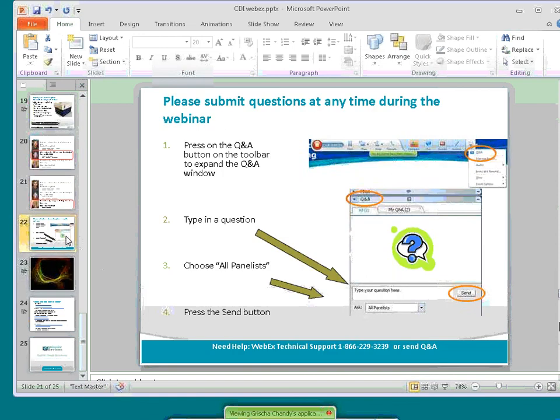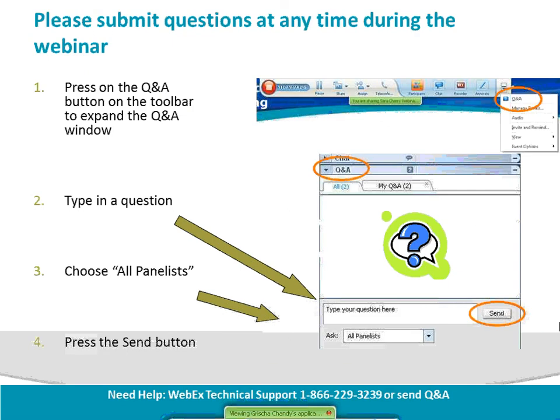While we are waiting, there was a question that came in earlier, directed to Oksana: how do you estimate assay quality, Z prime, Z factor? How do you do that?